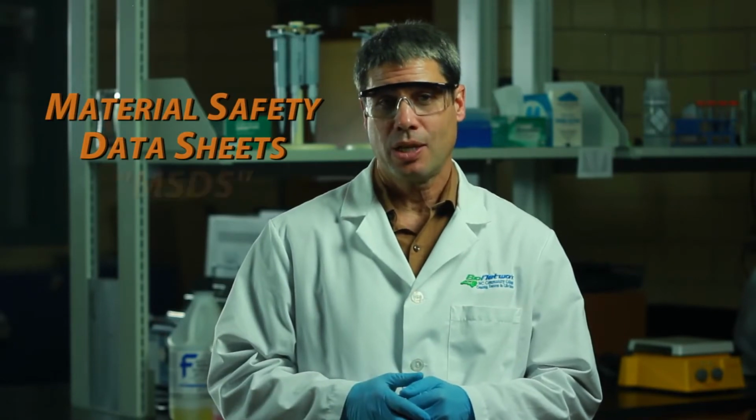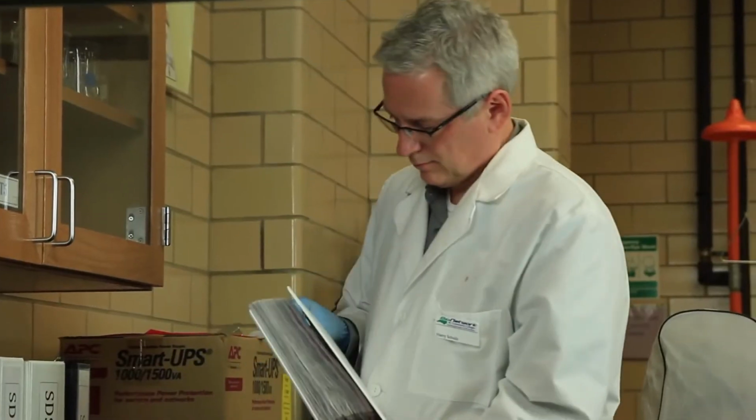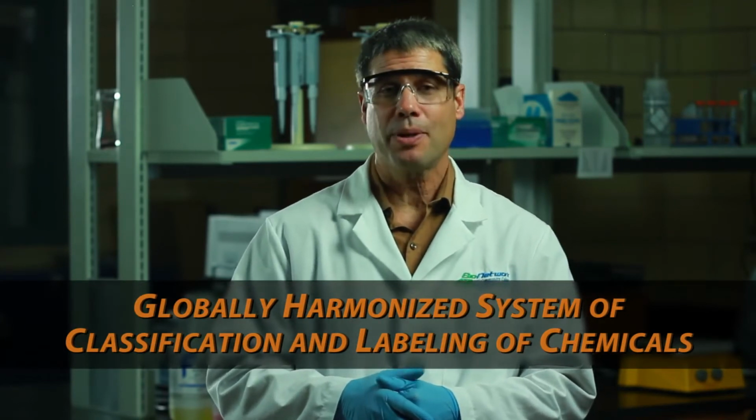These were formerly known as material safety data sheets, or MSDS. The safety data sheet is a one-stop shop to find out about a chemical's properties, hazards, and safety precautions. Know the location of the safety data sheets in your lab and review them before working with a chemical for the first time. GHS is an acronym for the Globally Harmonized System of Classification and Labeling of Chemicals.